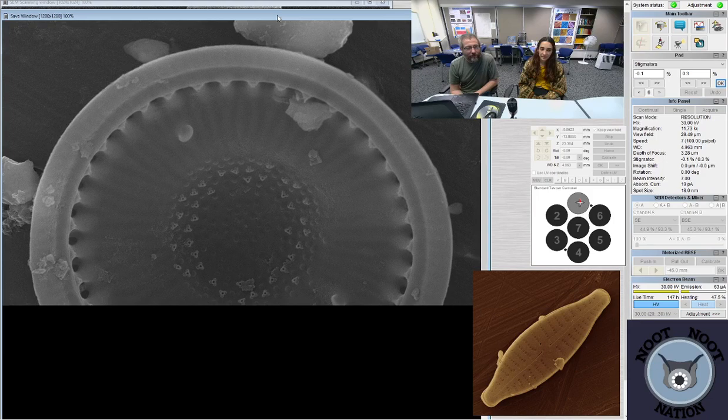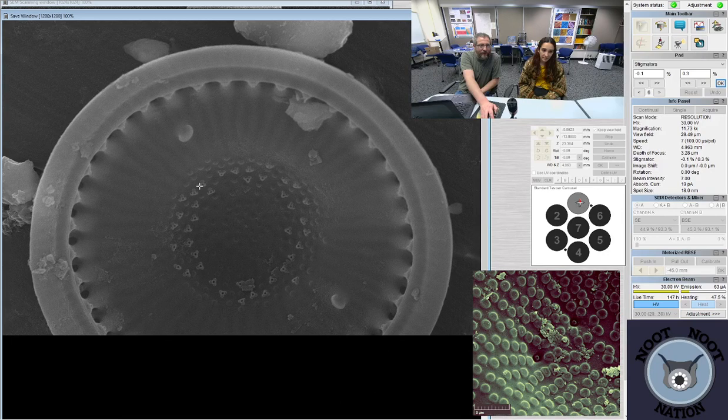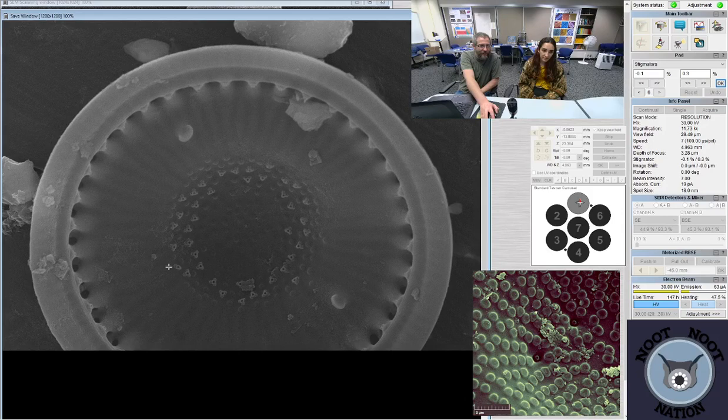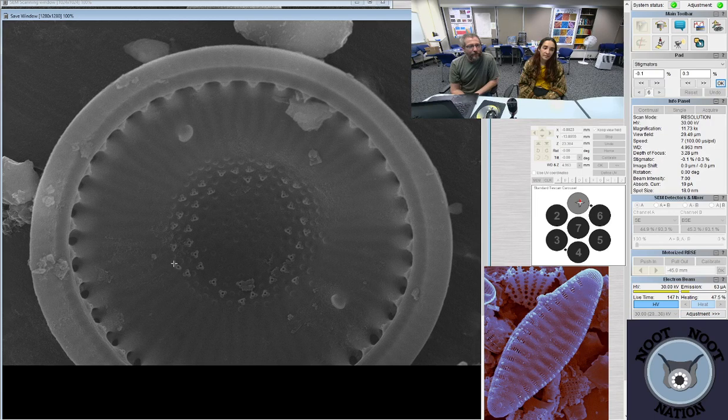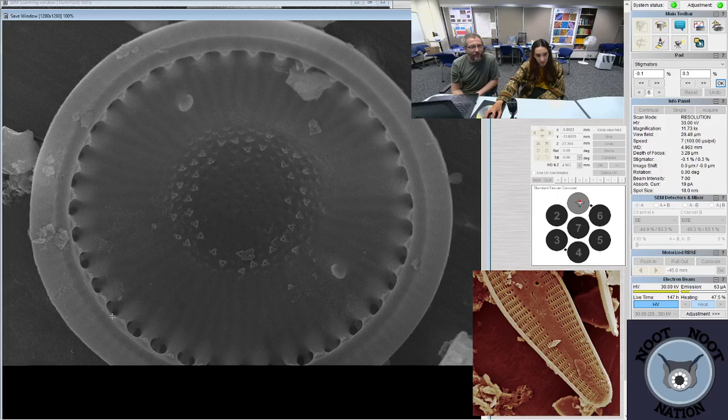So, you also see some of these little pores only have two. Very rarely, but usually three. They usually have three little satellite pores that make triangles, and then occasionally there's a little oddball in there, like that one that only has two. If we were able to look end-on at these things, the little edges of the bottle cap, basically, they would look basically the same. They're triangle-shaped. You can see down into some of them, but you can't see the bottom side.